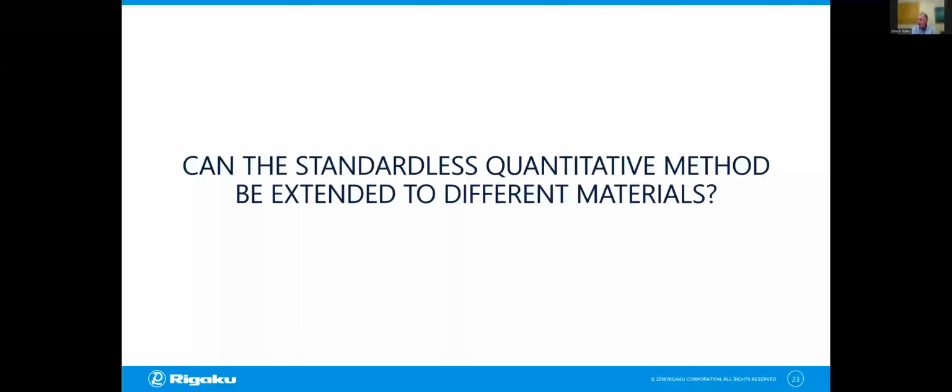Sure. Actually, Tom, I'm going to answer one of the questions that came in already. I think it's important. From Alexis, they ask, how does this compare to the direct derivation method? This is essentially the direct derivation method. I've avoided focusing on specific Rigaku tools and tried to keep it more general, but this is the direct derivation method. And as you go into it in more depth, hopefully that'll become clearer.